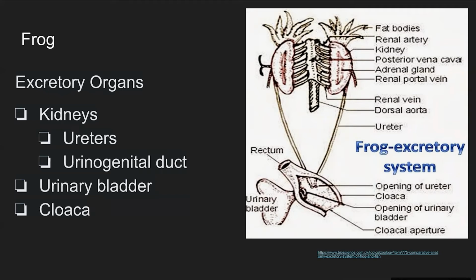The cloaca is an organ that is utilized for solid waste, liquid waste, and is essential for reproduction as well. It functions as an all-in-one organ and is the frog's only opening for each of these processes.